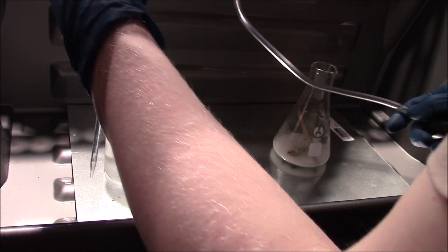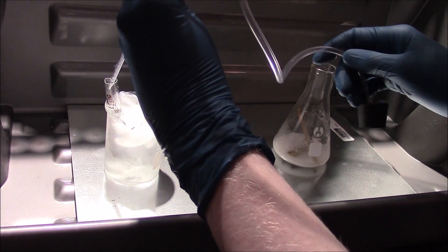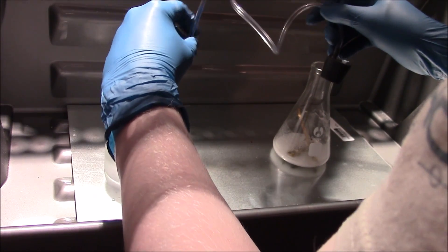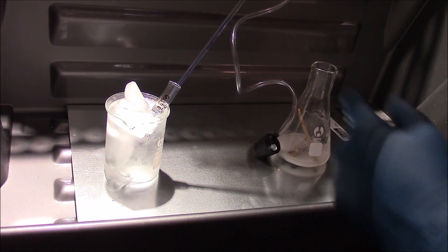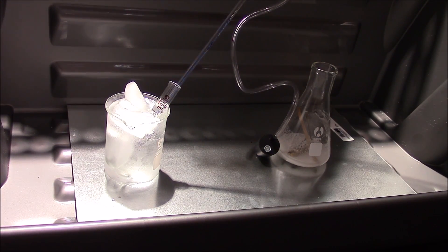We've got our hose ready — let me just insert the pipe head in here. The pipe is inserted into the cylinder, and now all we do is add our hydrochloric acid and just let it go.